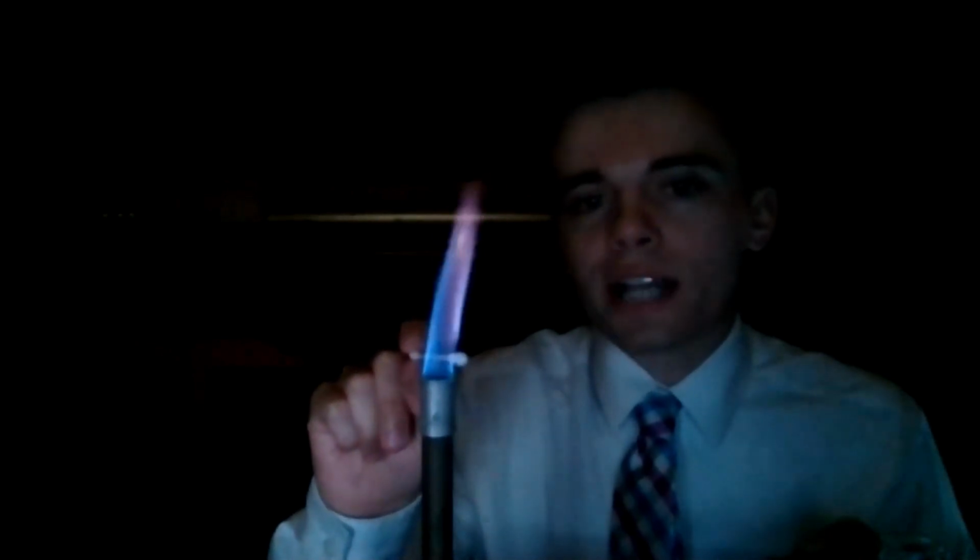For this one, you really have to look at the tip of the flame to see what color it is. See how it has that nice light purple almost hue to it? If you wanted to be really scientific or artsy, you could always call it lilac. It's a nice lilac color. I just call it purple or violet.